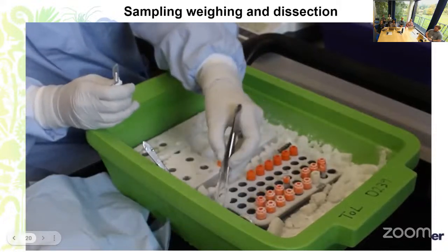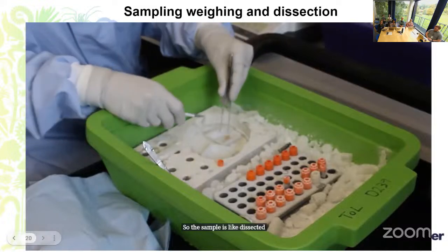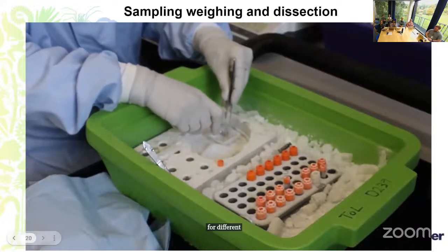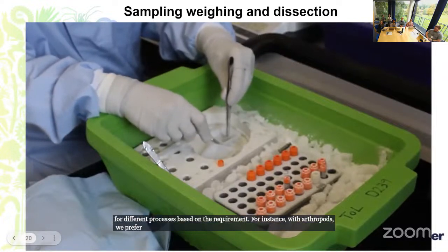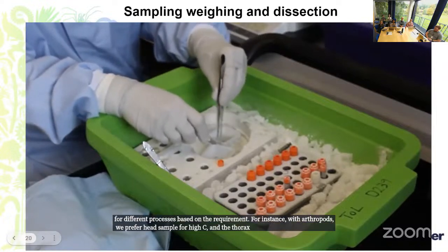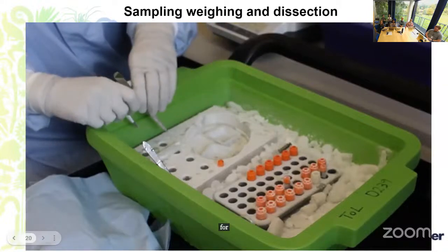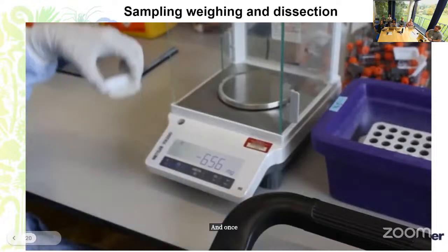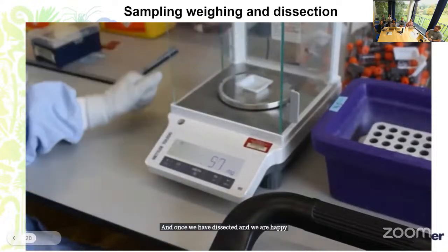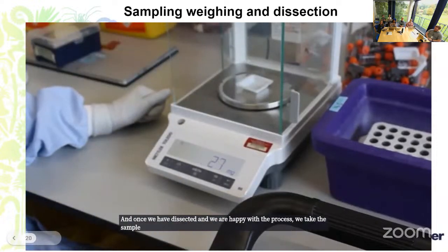So this sample is dissected for different processes based on the requirement. For instance, with arthropods, we prefer the head sample for Hi-C and the thorax for DNA extraction. And once we have dissected and we are happy with the process, we take the sample, weigh it again, and make sure it is within the range.